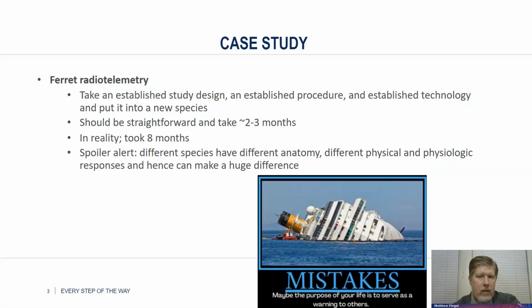And so we looked at that and we went, yeah, that should be doable. It's an established study design. We've run that in any number of lab animal species. It's an established procedure. We know the devices. We know how to place them. It's an established technology. It's just putting it into a new species. So this should be straightforward, and it should take about 2 to 3 months.